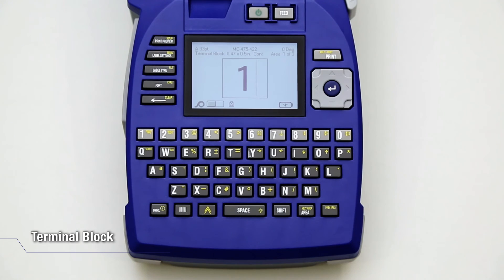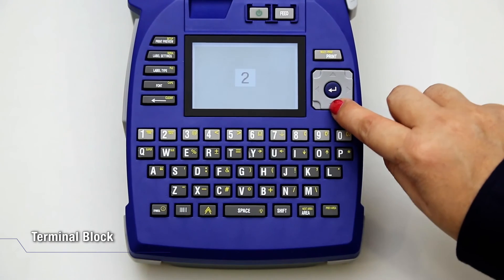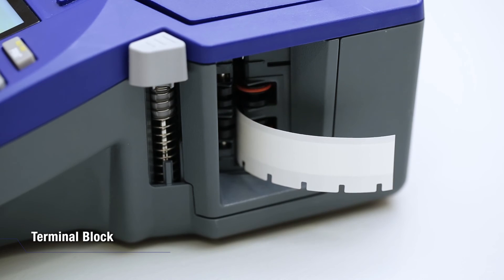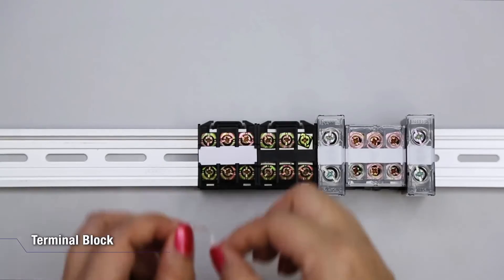Input more text if necessary. Check the Print Preview. Press Print.